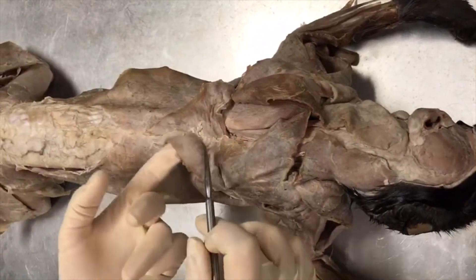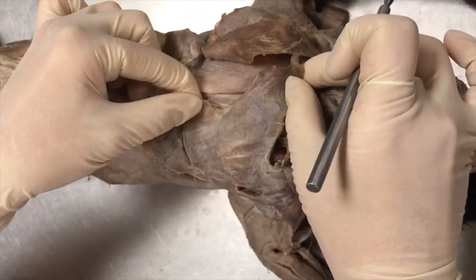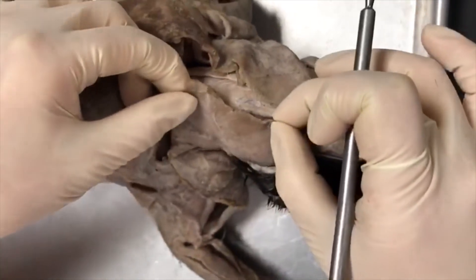This section here is going to be your spinal trapezius. This one here is going to be your acromiotrapezius. And then this upper one here, more cranial, is going to be your clavotrapezius.